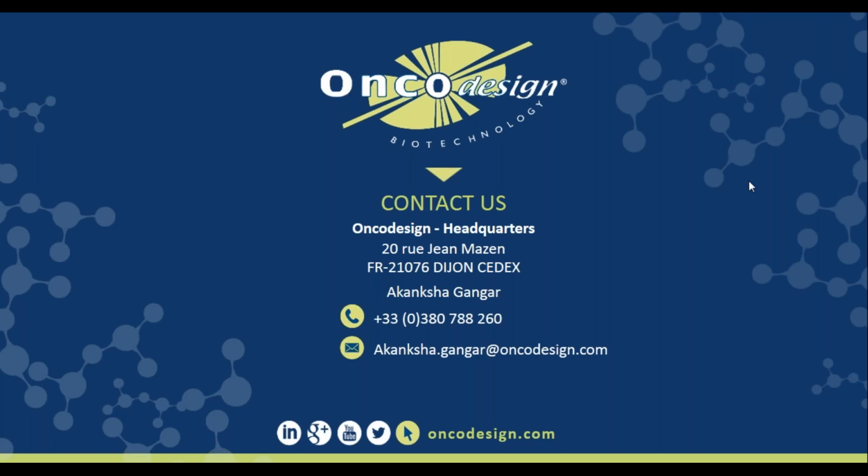But all in all, for the 10,000 screen, we took about 4 to 4.5 months to screen the entire compound library and to come up with a short list of ICD inducers that resulted in all the three markers.